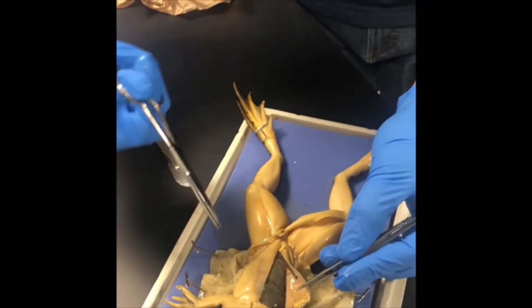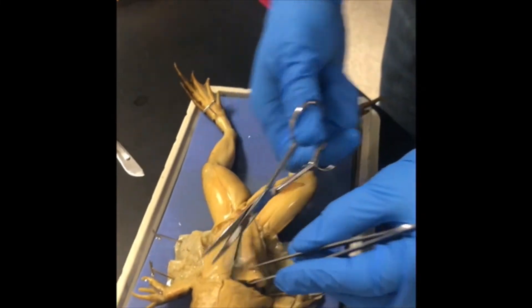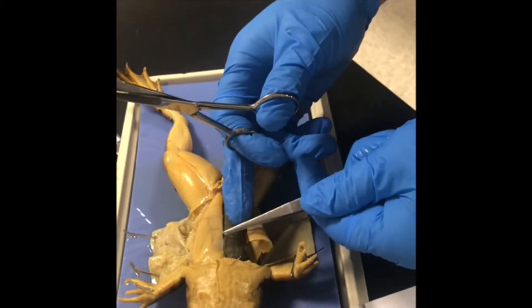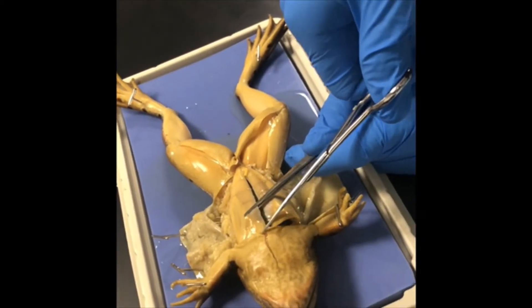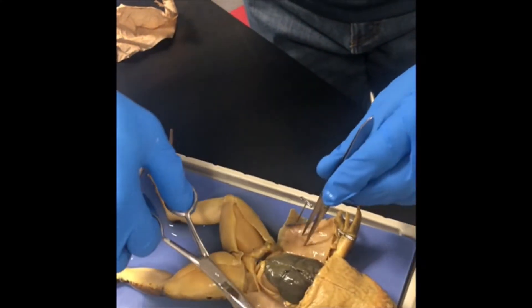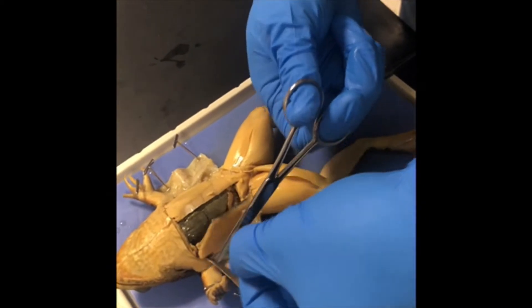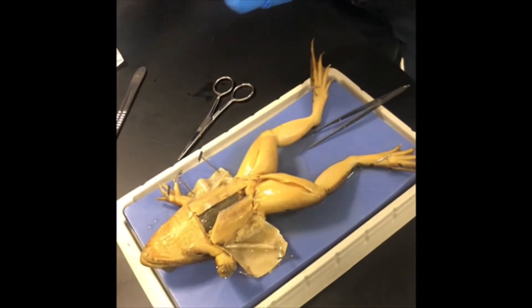When your scissors reach a point just below the frog's neck, you have cut far enough. The bone is right in here — turn the scissors to avoid damaging the organs. Cut a small piece of the muscle off and put it on your placemat, then pin the muscle flaps back.